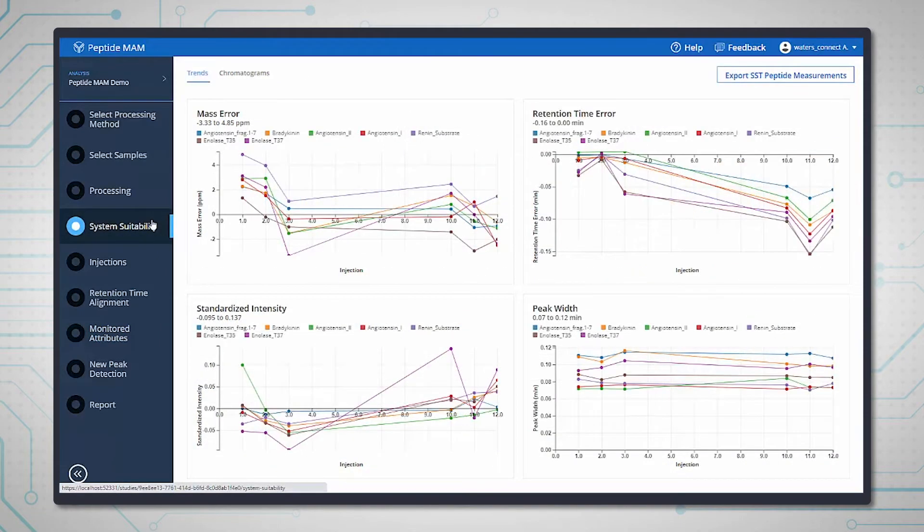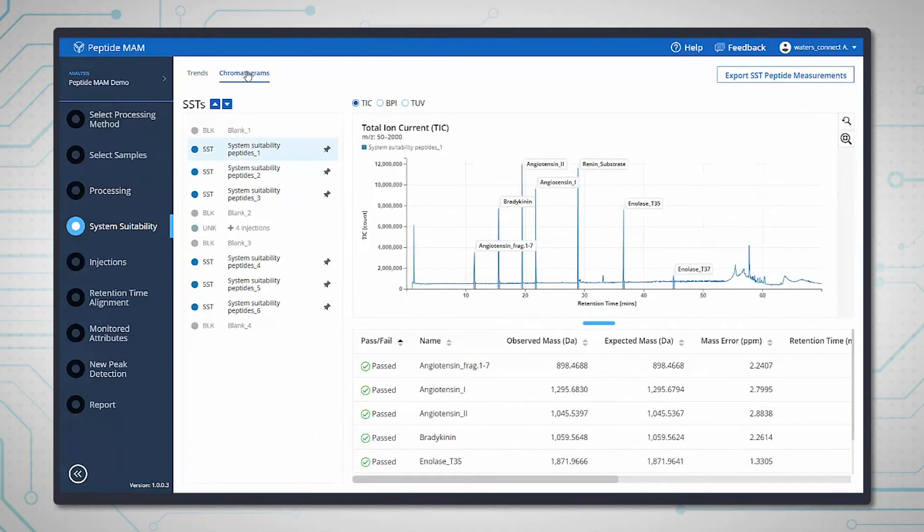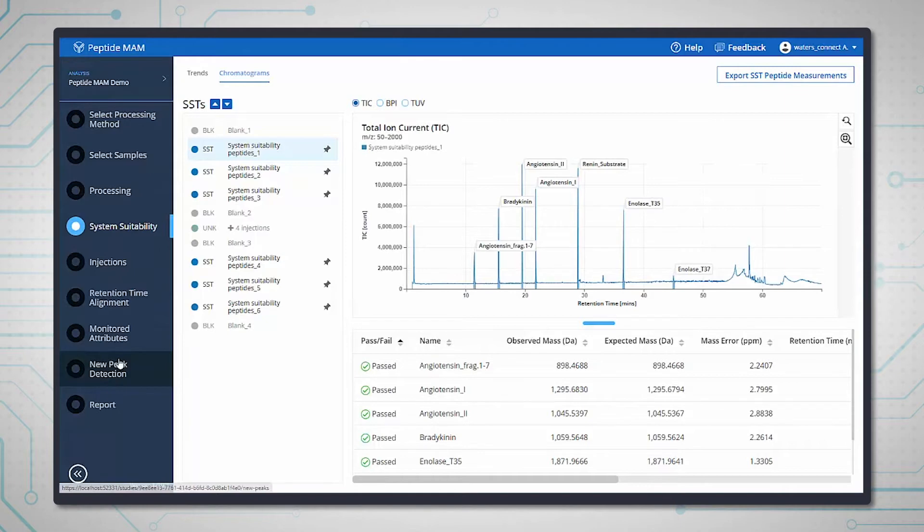The workflow also includes a dedicated system suitability test or SST step which means that system performance can be monitored across the run for added confidence.